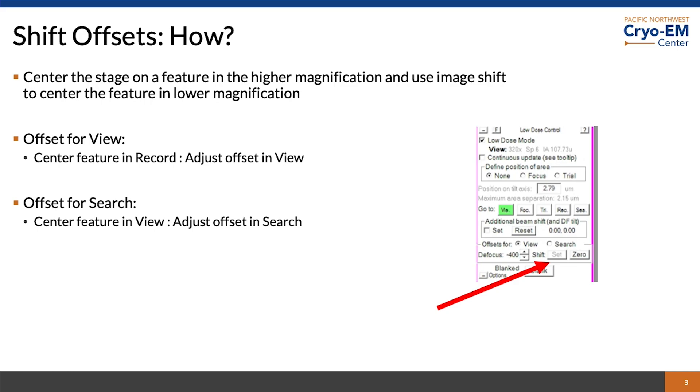After centering the stage in the high magnification, you acquire a low magnification image and center it with image shift. So that is right click on the feature and drag it to the center of the crosshairs. You'll see an image shift offset in the microscope dialog.